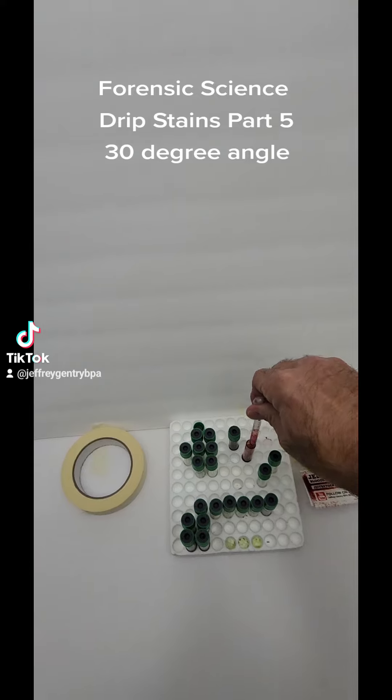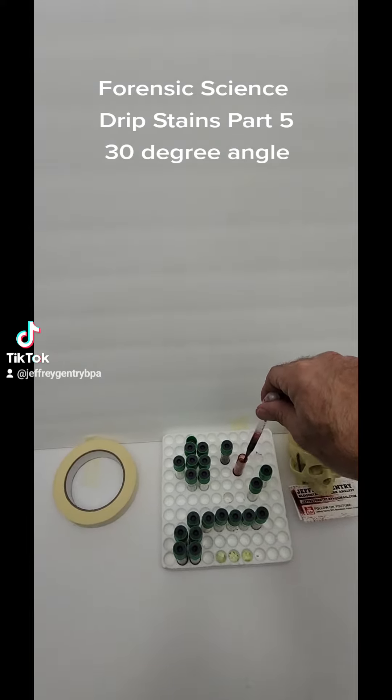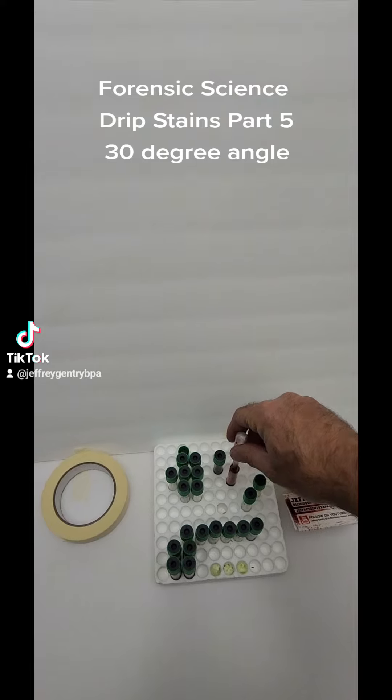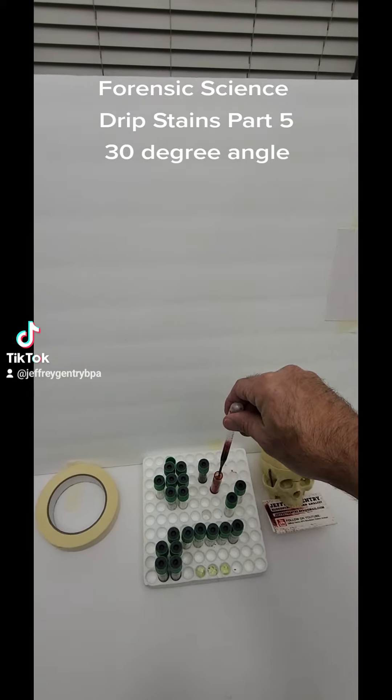I'll try to make three again. These do become a lot harder as the degree angle decreases. Trying not to get a lot of air in there, just because then it makes the stains have little bubbles in them.